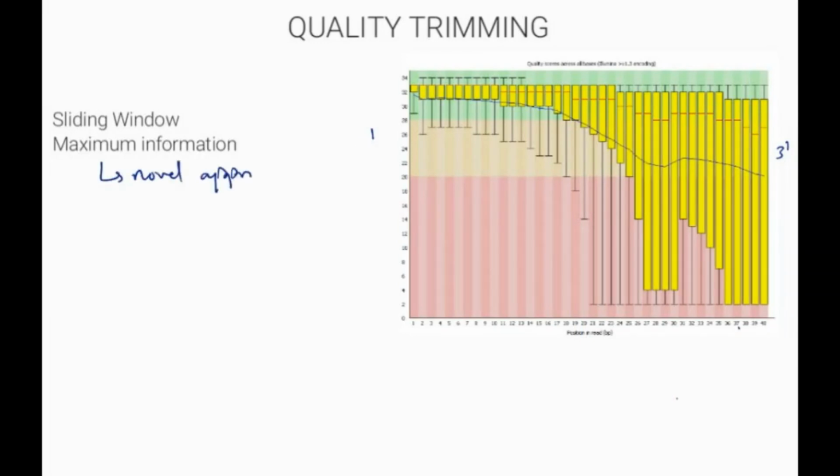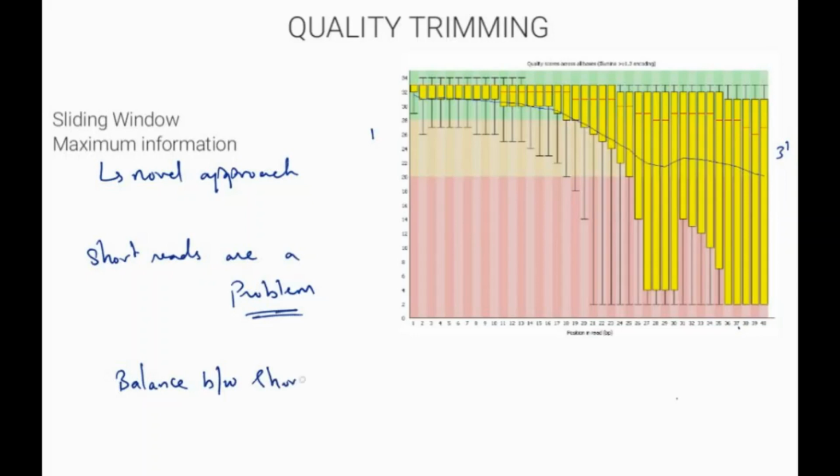According to the authors, this was created because for many applications, short reads are almost worthless because they occur multiple times within the target sequence and therefore give very vague and misleading information. Even though there is a risk of introducing errors because of retaining low quality bases in a read, it would be sufficiently long to be informative. However, too much retention of additional bases is, like the short reads, less beneficial and more detrimental. So we can conclude that reads of moderate length can be almost as valuable as full-length reads.